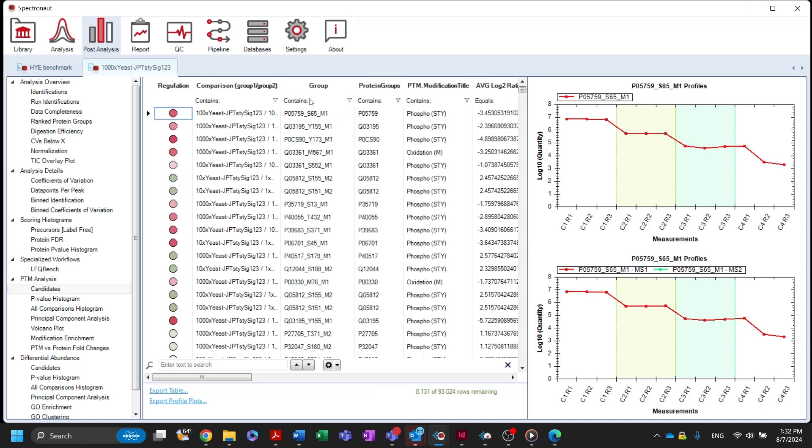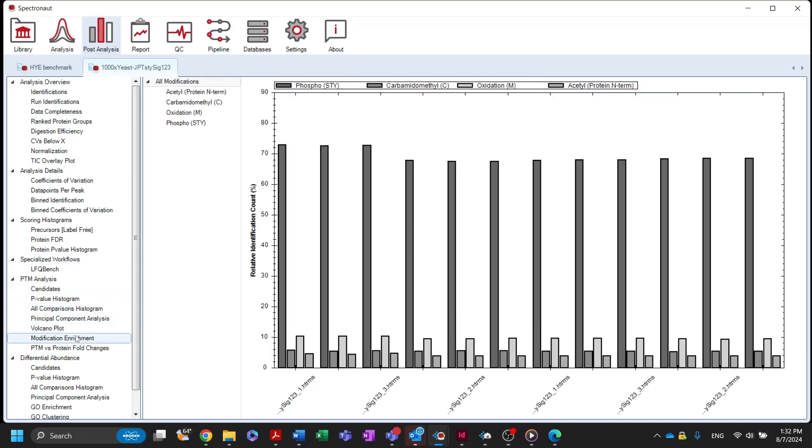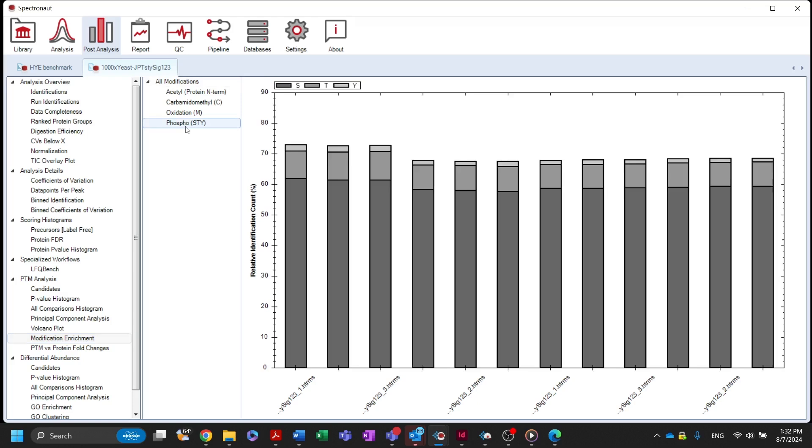Lastly, the modification enrichment plot visualizes the percentage of all identified precursors that are carrying a selected modification in each of the experimental runs. If the modification can occur on different amino acids, the plot will show the percentage of precursors carrying that modification on each of those amino acids.